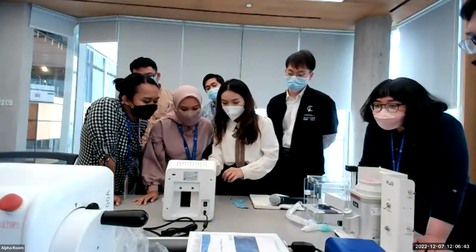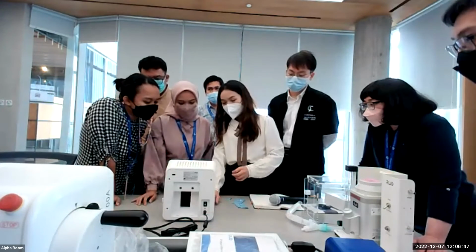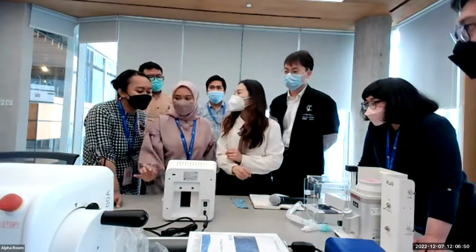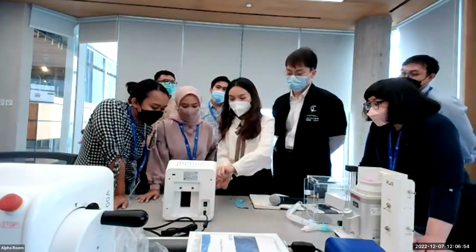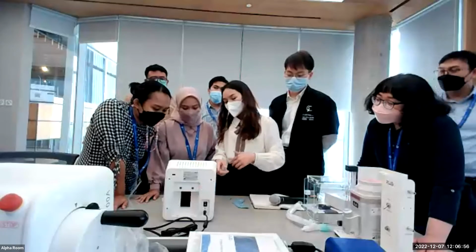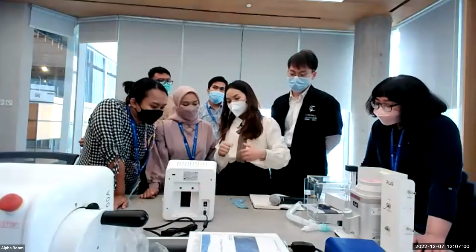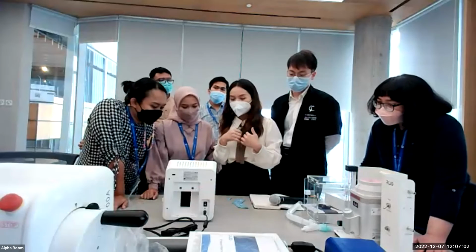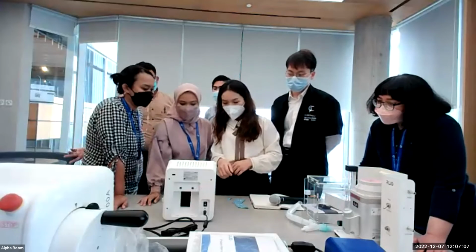And this one also can connect the USB. You can use a mouse. Two USB ports, this one and this one. One for connect the USB, another one can use another USB to output or input the data. How to export the data?